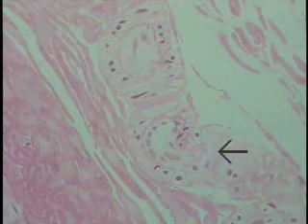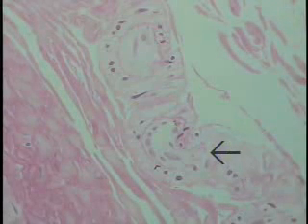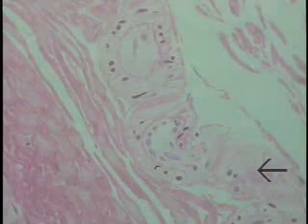And then the arteriole courses out of the field of view here, and we can see we're again cutting it obliquely, or tangentially I should say, just nipping the outer wraps of the media wall.